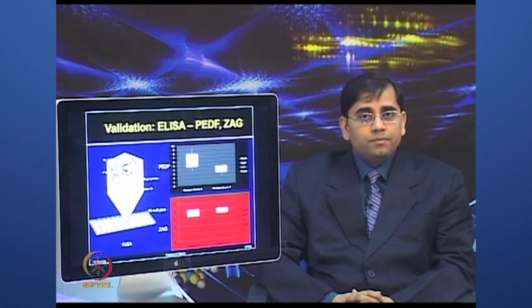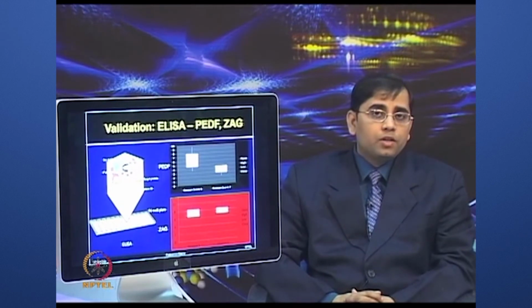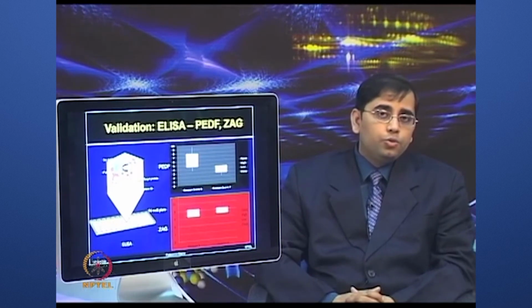So, this ELISA validation confirmed their findings from the 2D DIGE experiments.